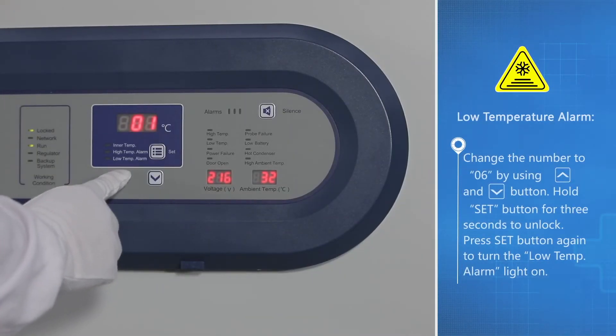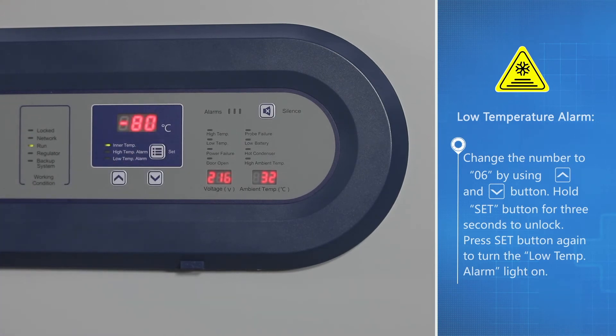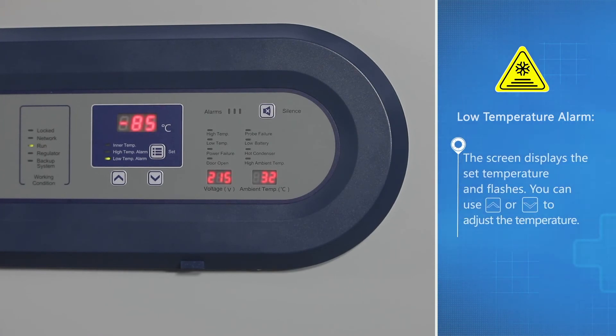Low-temperature alarm: change the number to 06 by using the up button and down button. Hold the set button for three seconds to unlock. Press the set button again to turn the low temp alarm light on; the screen displays the set temperature and flashes.